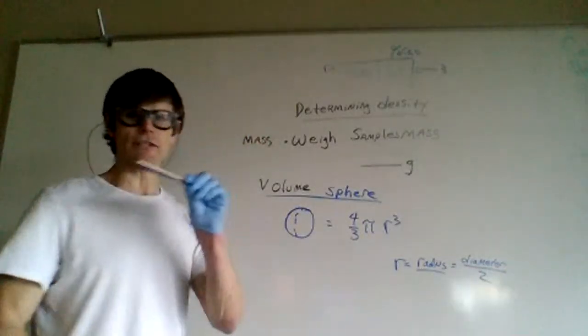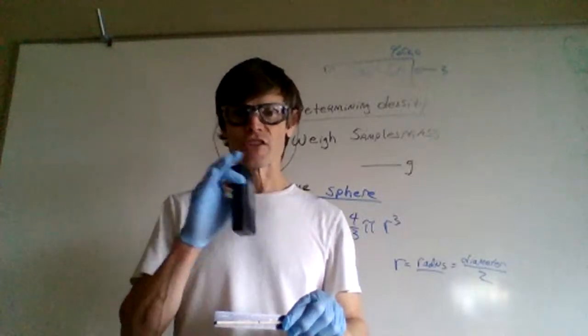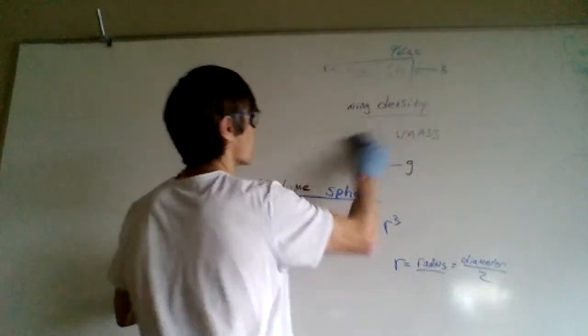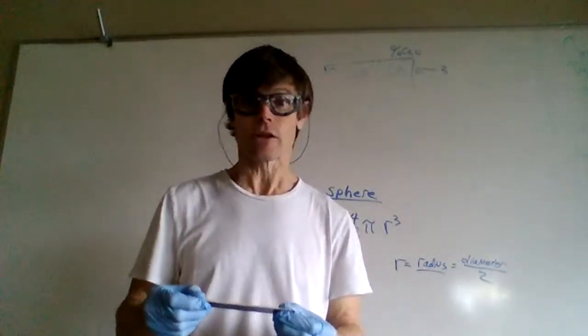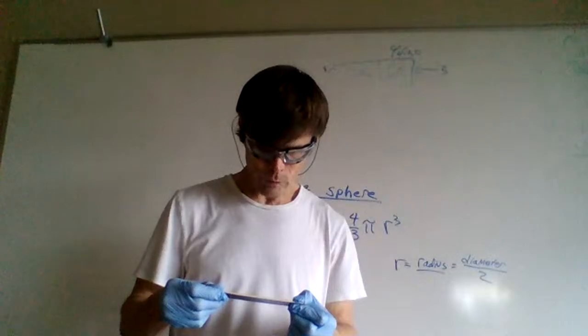Let's take a look at this little exercise so we understand a little bit about significant figures too. We did this exercise earlier. I'm going to look at this carefully and write down what I saw. You can verify it when you look at this video.